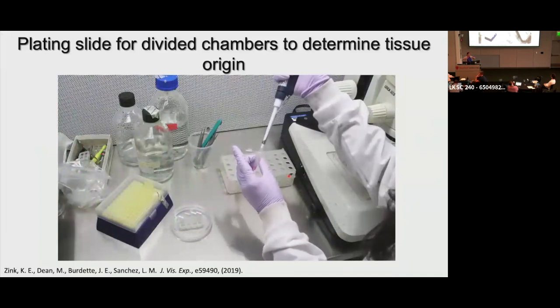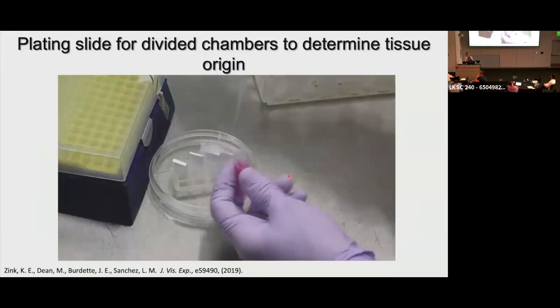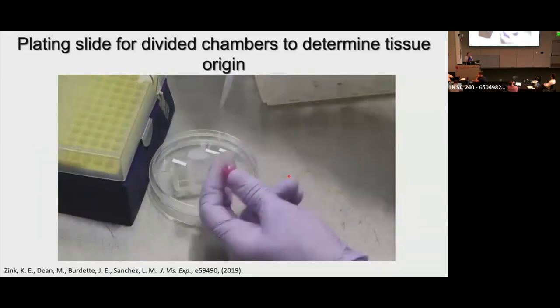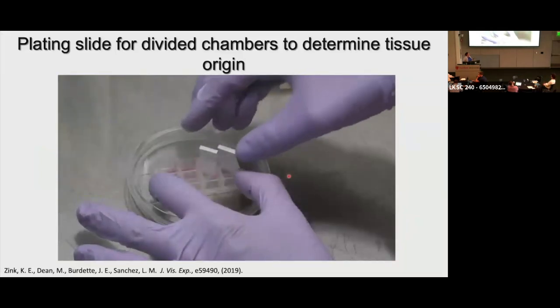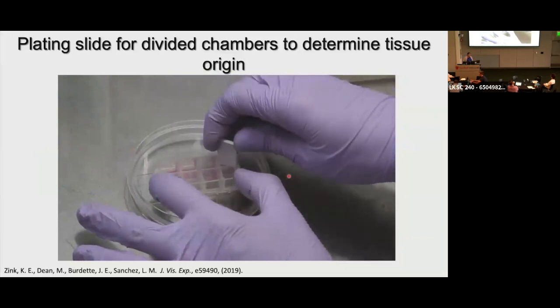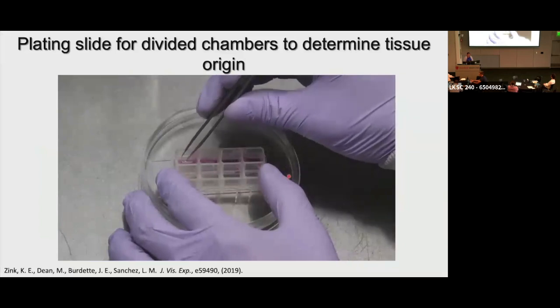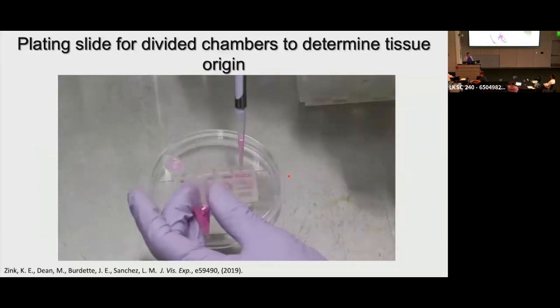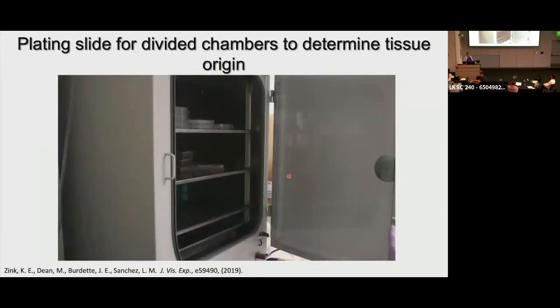So this time we're physically separating cells from the healthy explant tissue, allowing the co-culture to occur for 4 days, and then taking our measurements to try to address which of these two things was actually making that signal that we saw increased. And so you can see this is pretty easy. They come out, 150 microliters, dries really quickly. So this was a really nice protocol for us that we still use to this day for how we analyze when we want to know the cell or tissue of origin for these. Okay, and then it incubates again.